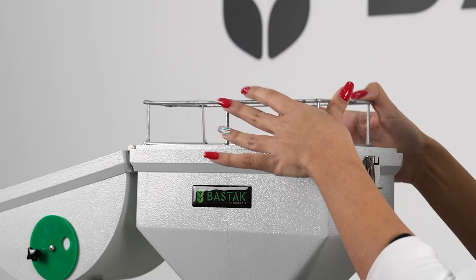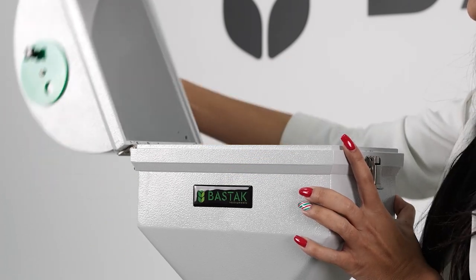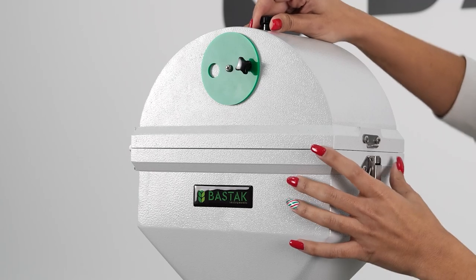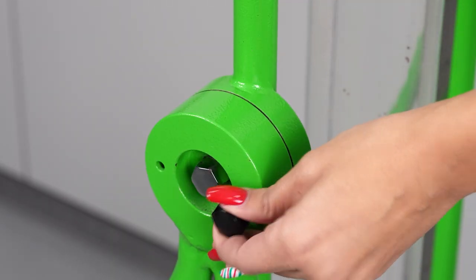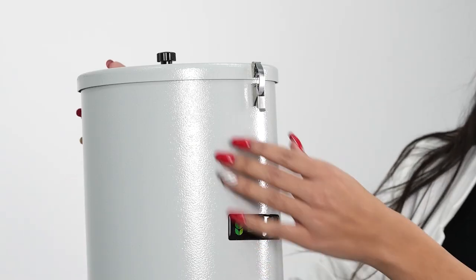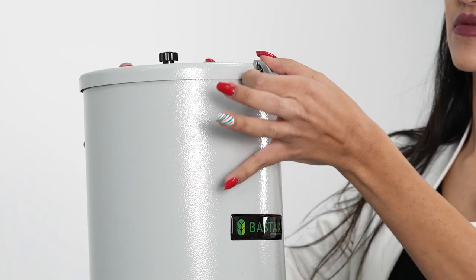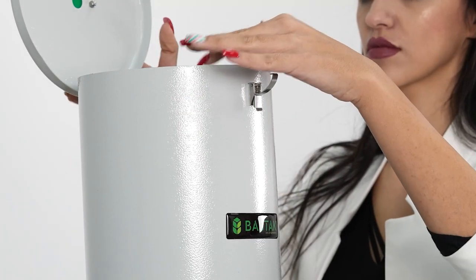A specially manufactured wire chamber is placed into the device's second sample chamber. Subsequently, after pulling the pin in the support skeleton system, the chamber earmarked for measurement is inverted in a downward position. The cover of the sample chamber is opened and an excess of seeds is filled until it reaches the zero level mark on the measuring ruler.